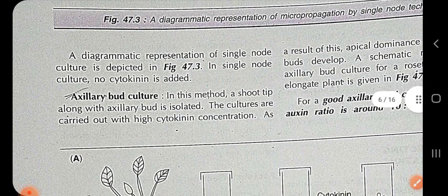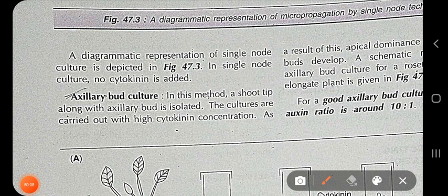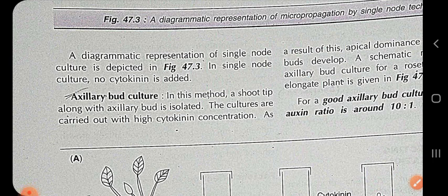So in axillary bud culture, shoot tips along with axillary buds are isolated. The cultures are carried out in high cytokinin concentration.